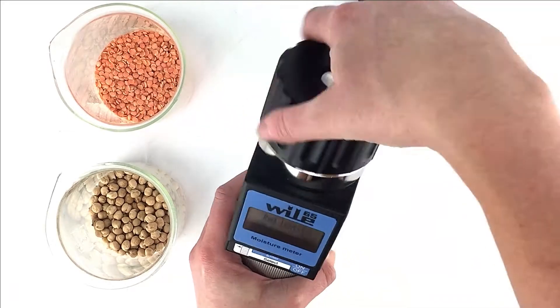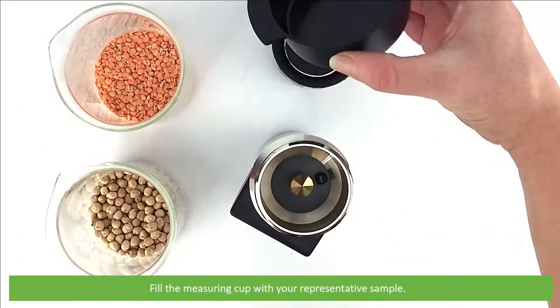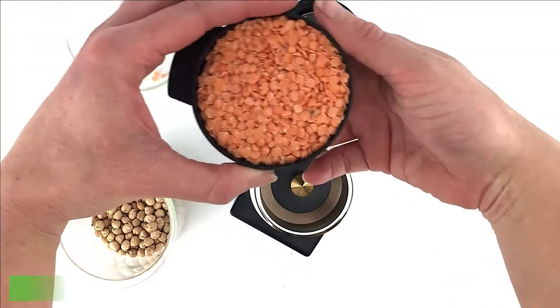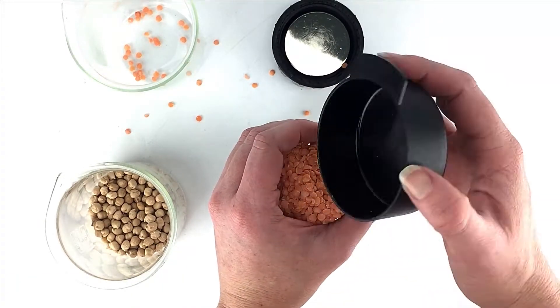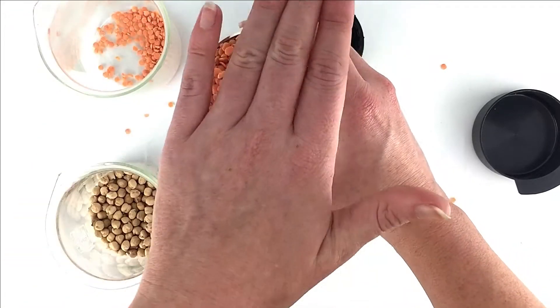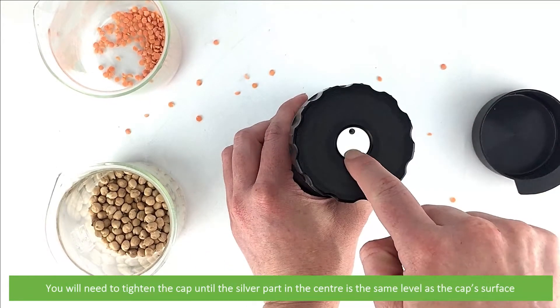Time to take a measurement. Fill the measuring cup up with your representative sample. Then fill the top of the moisture meter. When the measuring cup is filled to the brim, wipe off any excess grain. Place on the cap and twist. You will need to tighten the cap until the silver part in the center is the same level as the cap's surface.